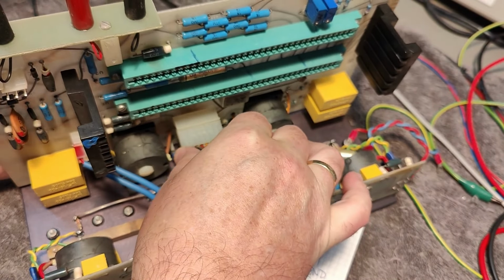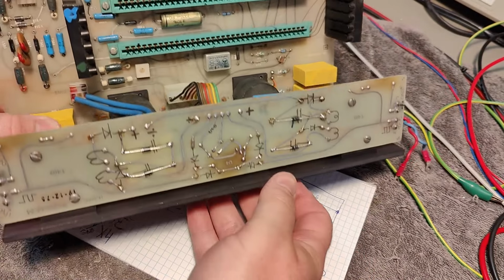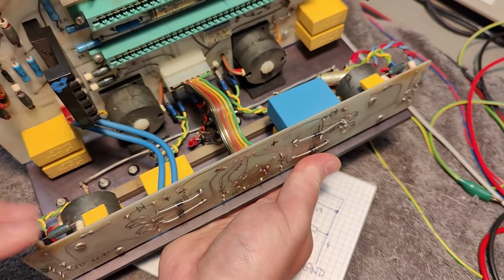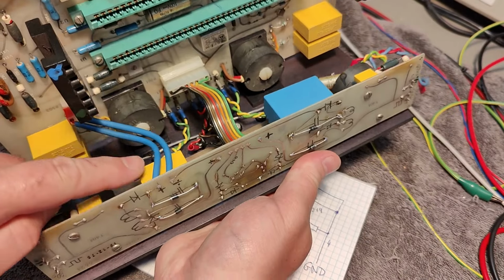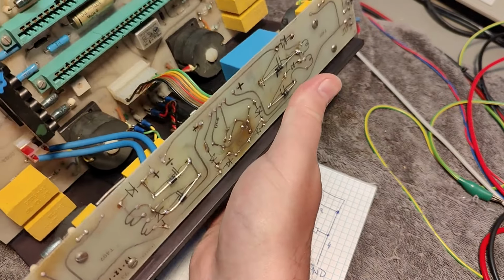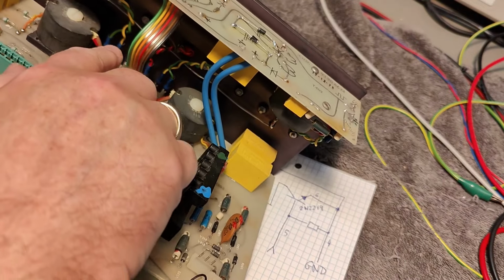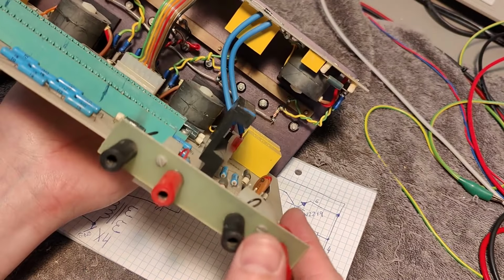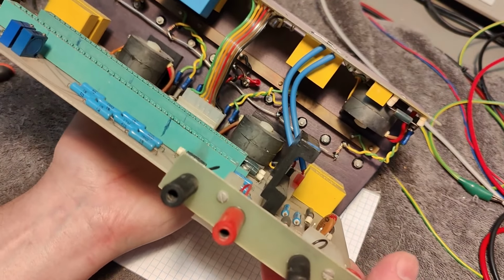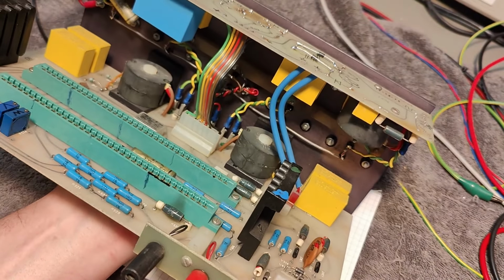And here is the connector, like that. And then I should just try and plug it in. Now the loop is closed. We got all the high voltage converters running. And the only thing I really would like to see is the AC signal that drives the PWM. Maybe I can sneak this out from the driver board and get my scope to monitor this one at the same time. I think that's a good idea.